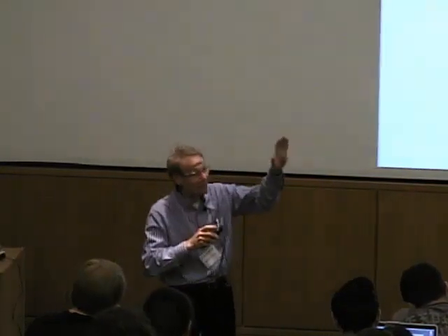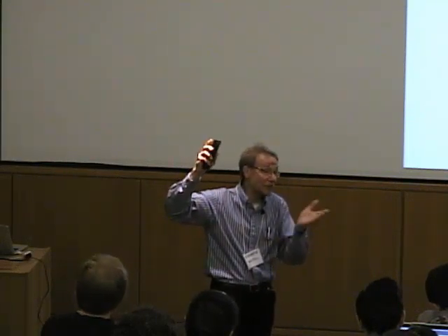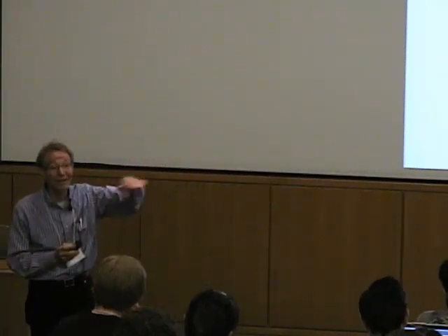Question here. Is it fairly easy to change the temperature within the box? Yes. You want to run it at body temperature? Yes, exactly. So good point. Most of the data is collected at 25 degrees. That's kind of standard conditions. But 37, fine. Up to 40. And oftentimes when you're looking at a temperature dependence, you'll run data from 10 up to 40 at different values. But remember, it's isothermal, so all your data is collected at one temperature.